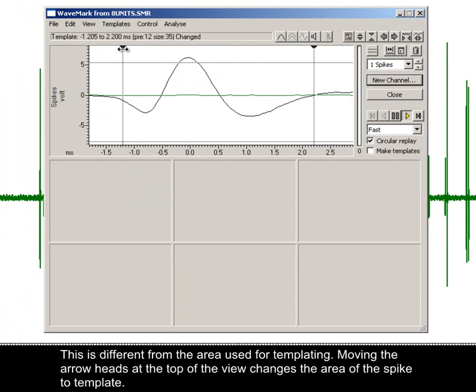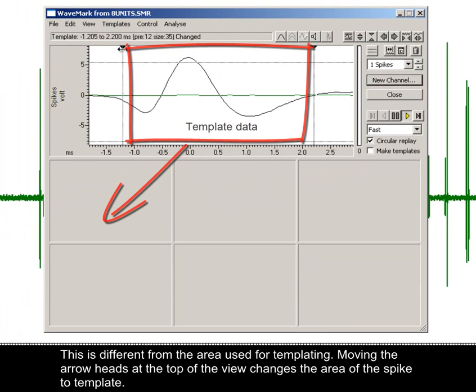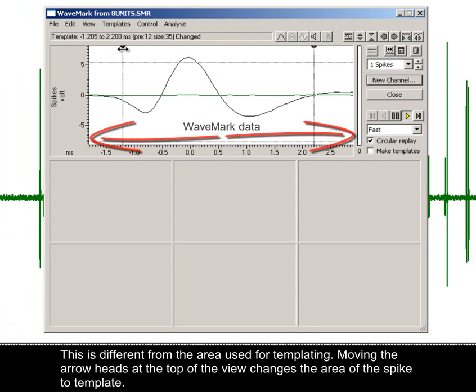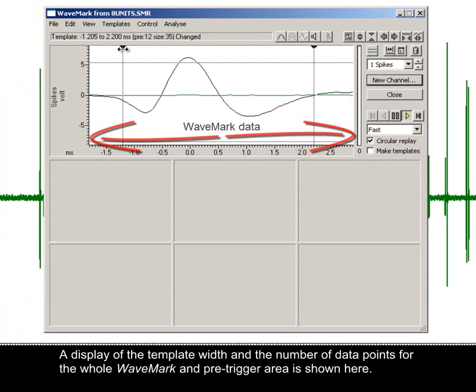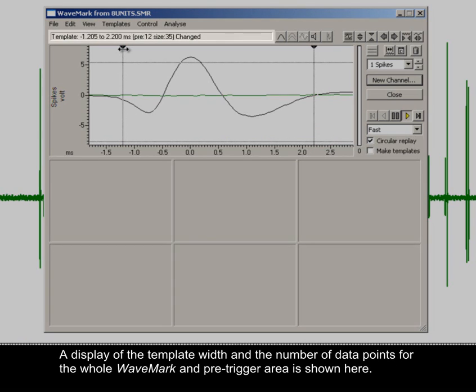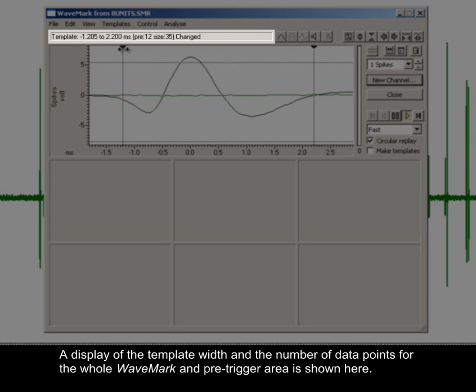Moving the arrowheads at the top of the view changes the area of the spike to template. A display of the template width and the number of data points for the whole wave mark and pre-trigger area is shown here.